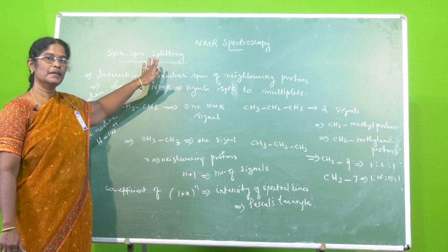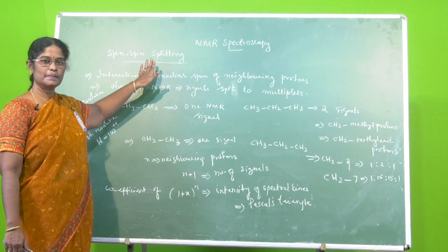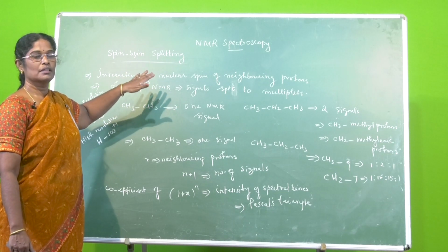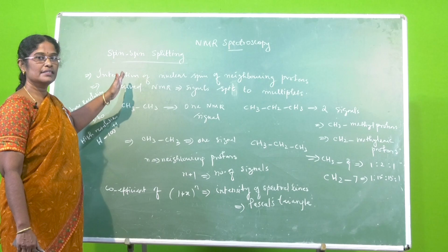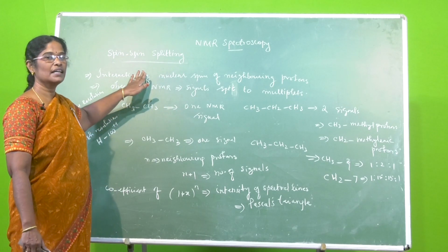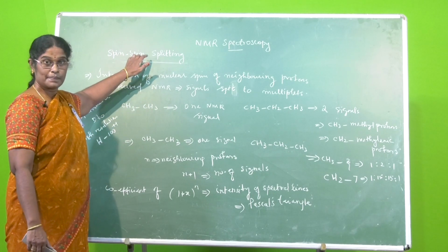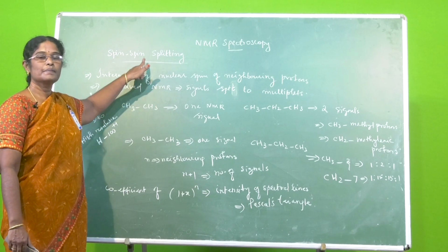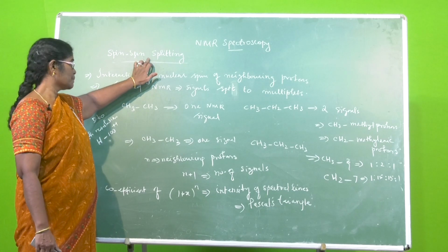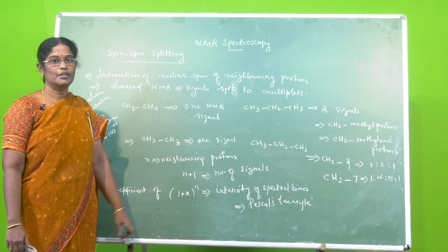As we understand the other parameter which is a consequence of nuclear magnetic resonance, nothing but spin-spin splitting. The neighboring environmental protons interact with the already existing magnetic resonance, causing the signal lines to be split as a hyperfine splitting, and the effect is referred to as spin-spin splitting, and it is an inverse case of spin-spin coupling. But the magnitude of spin-spin splitting will be measured in terms of spin-spin coupling values, which are referred to as the J values.